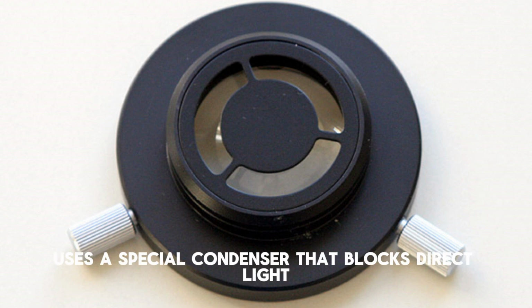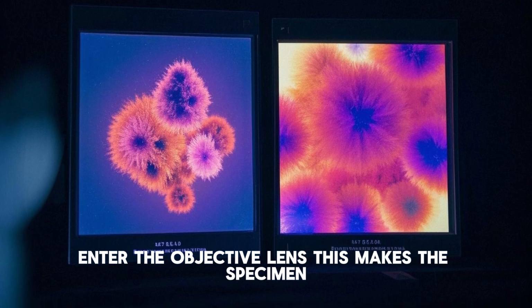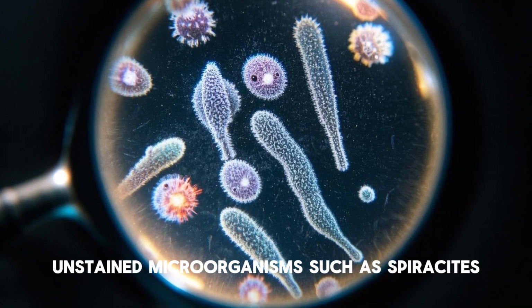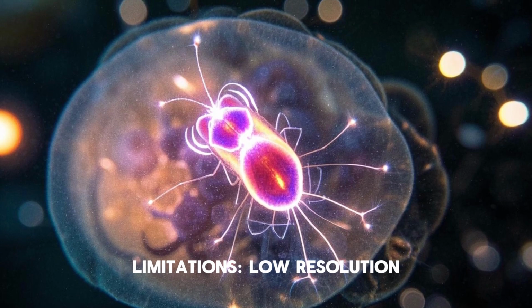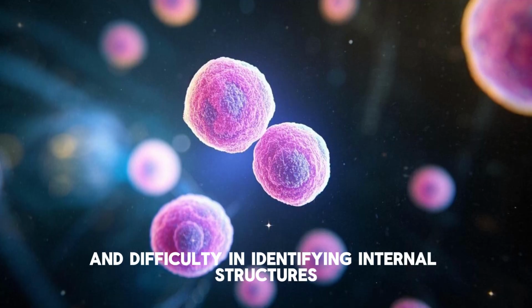Principle: uses a special condenser that blocks direct light and allows only scattered light to enter the objective lens. This makes the specimen appear bright against a dark background. Best for observing live, unstained microorganisms such as spirochetes. Example, Treponema pallidum. Limitations: low resolution and difficulty in identifying internal structures.